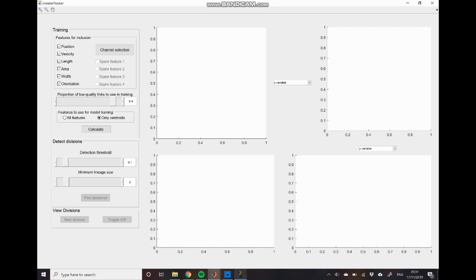So to begin we want to perform this training of the model and usually what I do is I just use this positional feature. As I say division events are much sparser than the original tracking data so we tend to be able to just use this position information instead of integrating lots of different features together. That's just going to make life easier in subsequent steps.